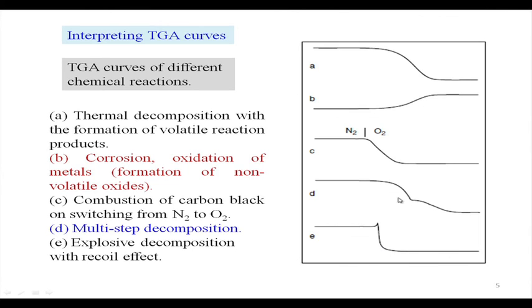So, looking at all these different shapes and curves for your TGA analysis, we should be able to at least comment on what sort of curve, what sort of plot, and what sort of degradation we can have for a particular type of analysis.